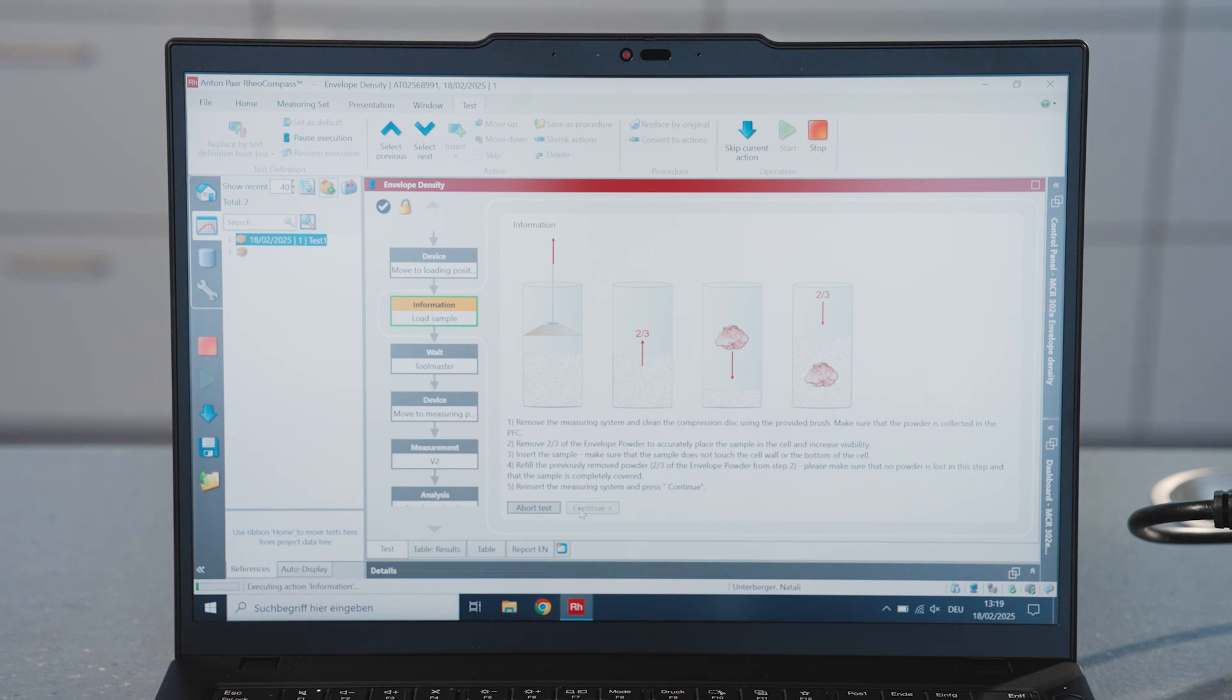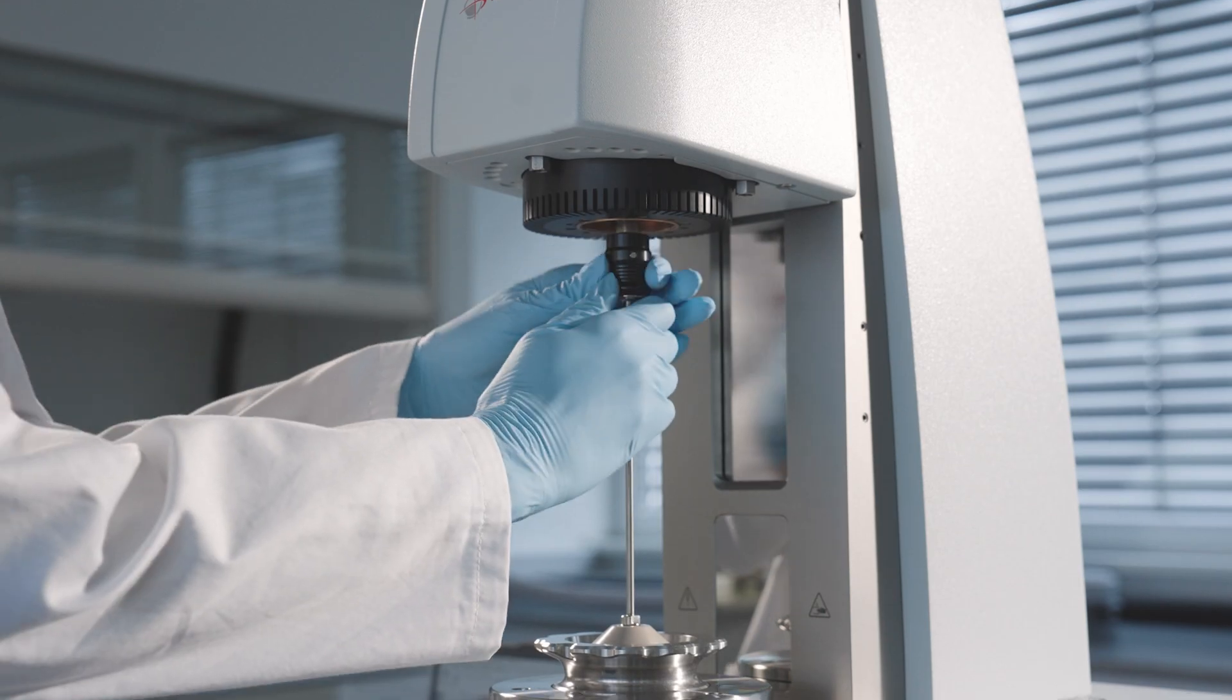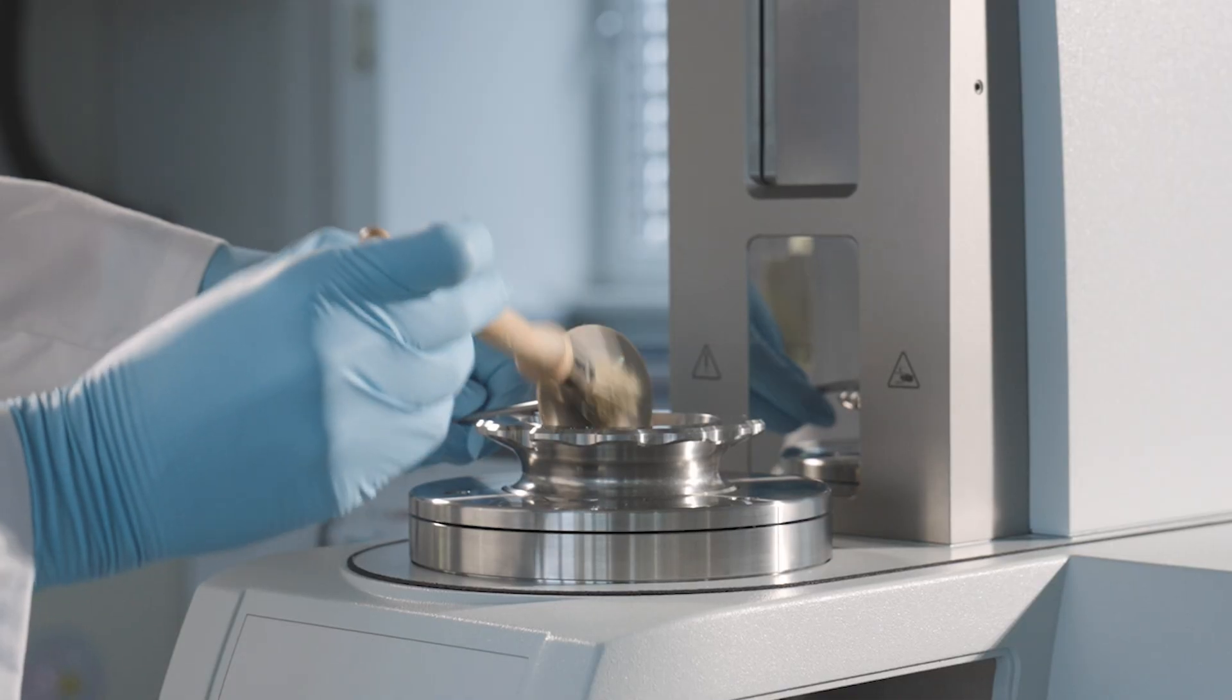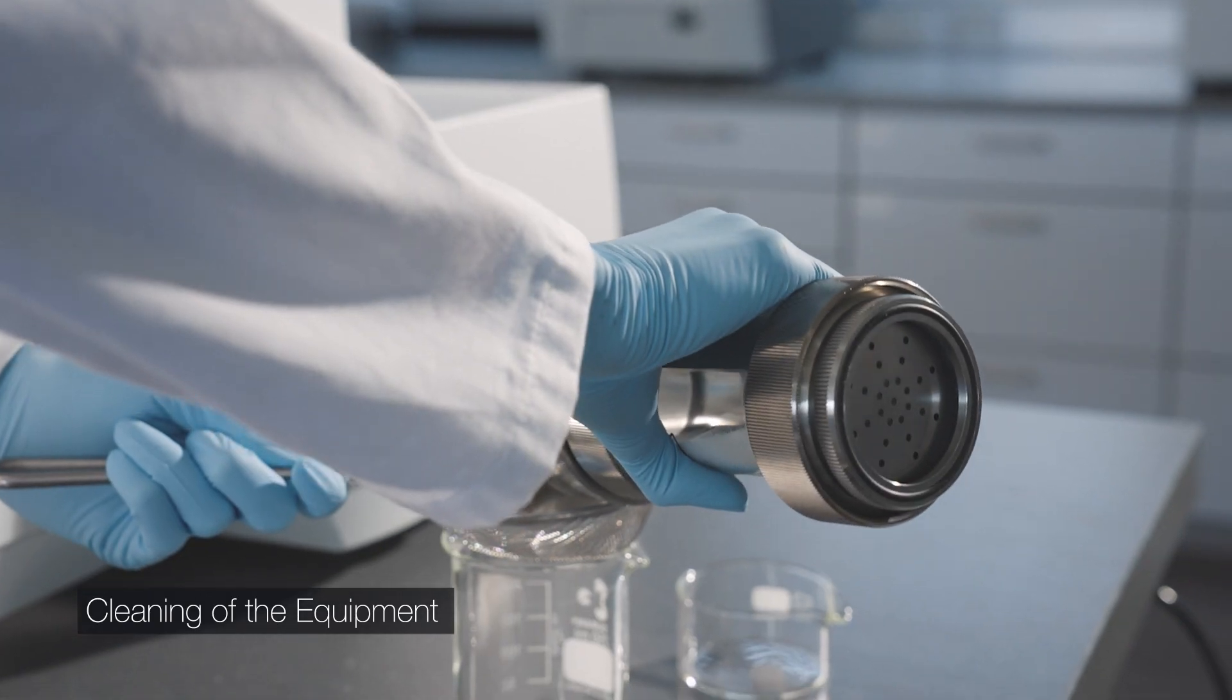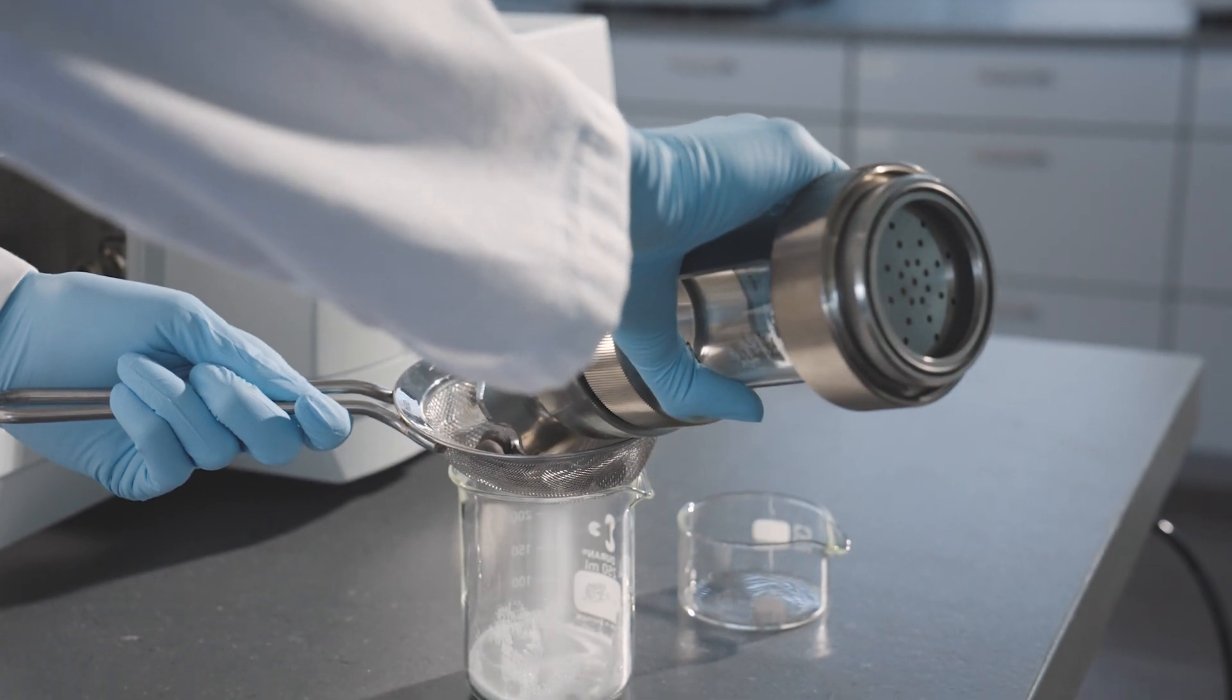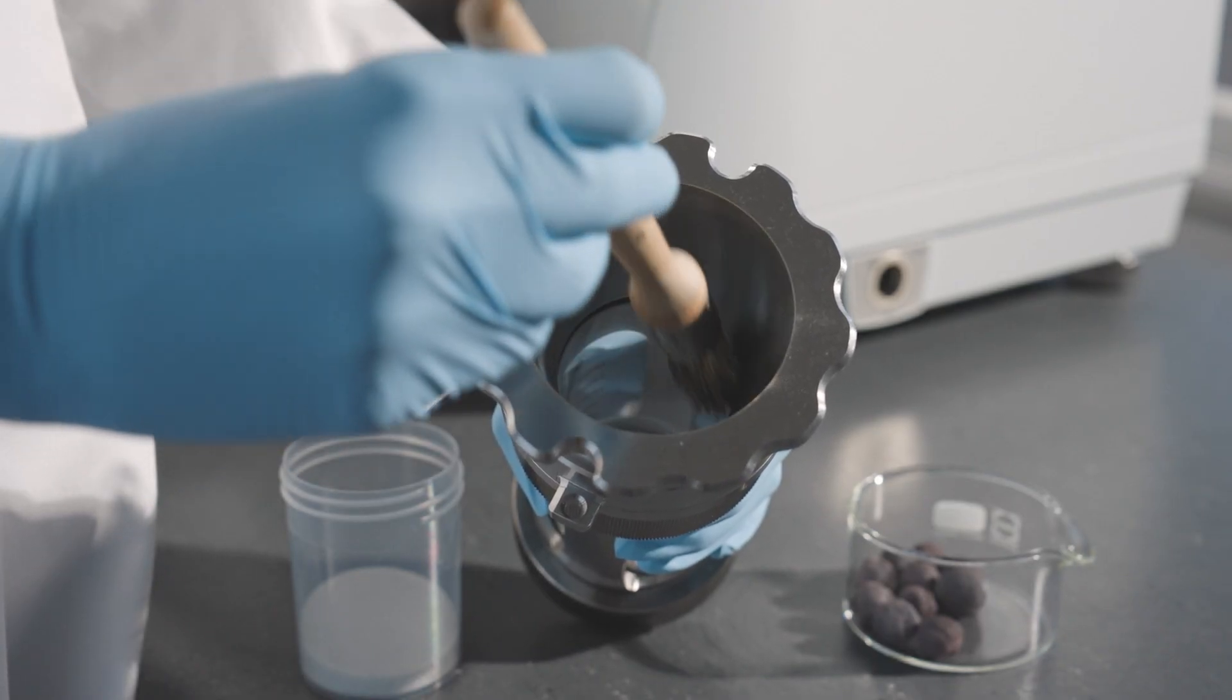Press Continue to finalize the measurement. Remove the powder flow cell. Use a cup and the separating sieve. Pour the entire filling of the measuring cell into the sieve. Use the brush for the final finish.